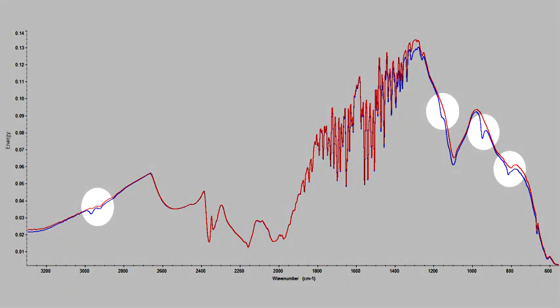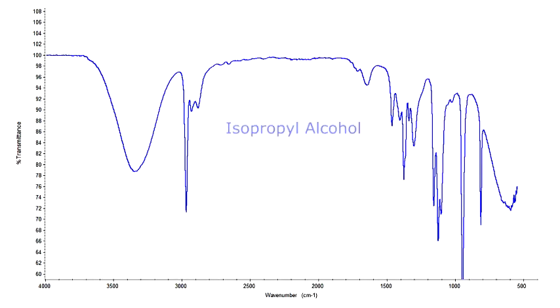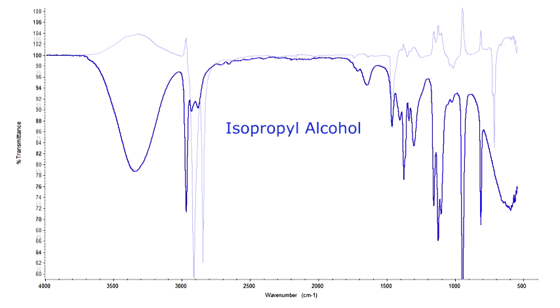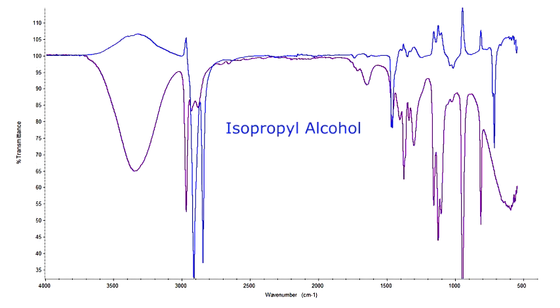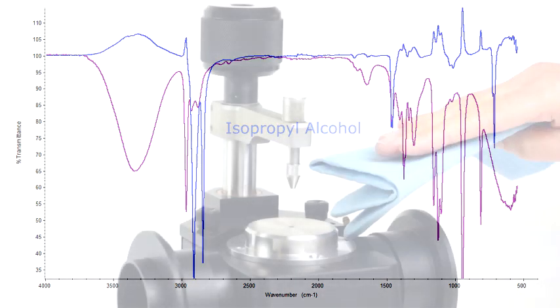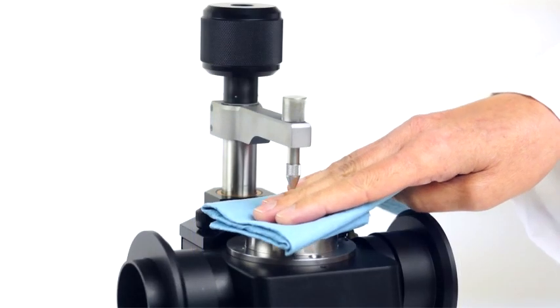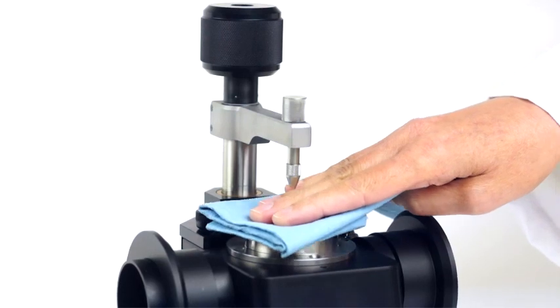In this case, I recognize the source as my cleaning solvent, isopropyl alcohol. There was residual solvent on the crystal surface, which indicates the crystal was not sufficiently dried before collecting the sample spectrum.